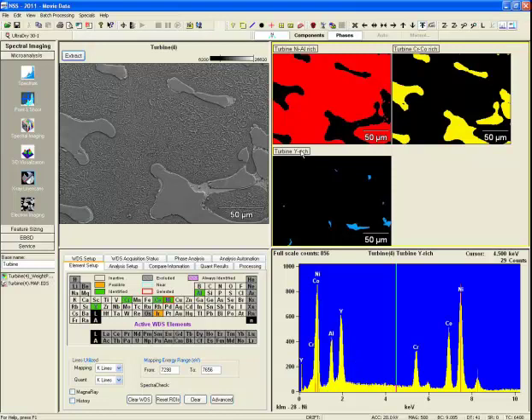And if we click on the legend for that phase, we can see that those are regions that are at the edges of the existing phases and also webs between the globular phases. So those are regions that we may not have seen visually in the electron image, may not have popped out at us as being quite obvious, but statistically they are all similar compositions in all of these regions across the sample, and it has told us that this phase is available at all of these pixels within the field of view without us having to know that yttrium is a constituent in this actual material.